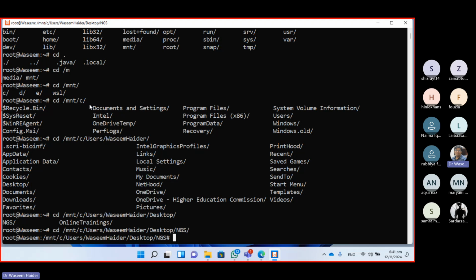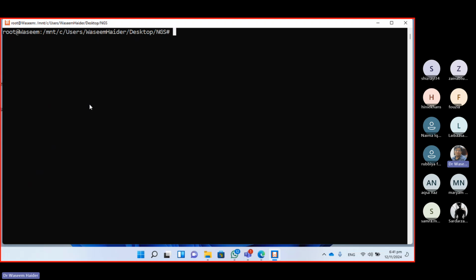We can press Control and L together, and the duster will wipe everything. The up arrow key will repeat the previous command. Pressing it twice gives the one before that, and so on. Whichever commands you ran are stored in memory, so you can reuse them. If you press the down arrow key, you go back towards the present, the newest commands, and up arrow for the older commands.